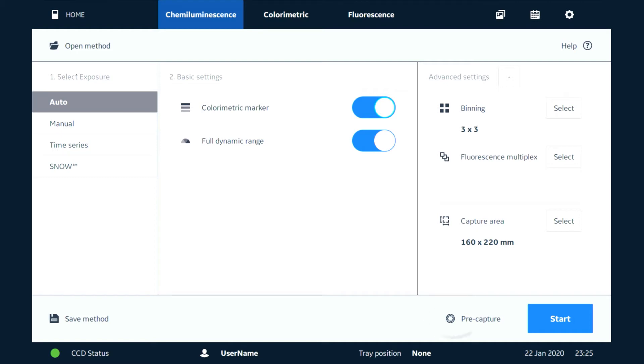There's also an option down here to do a pre-capture, so this is like a semi-auto mode where the camera will actually pause in the middle of taking the image so that we can define a region of interest to actually perform the capture on.